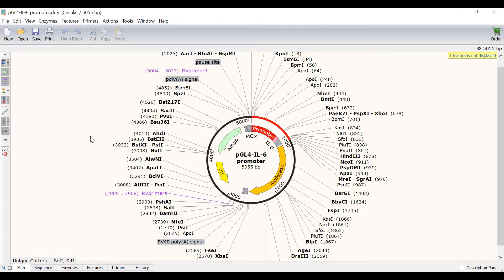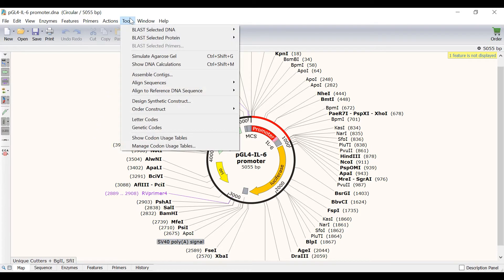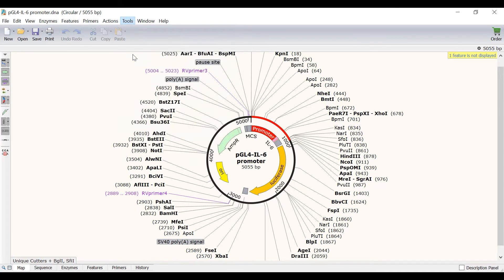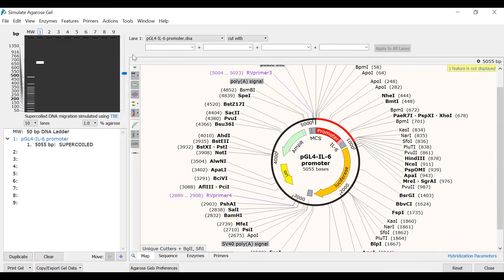To simulate agarose gel electrophoresis, go to Tools, then Simulate Agarose Gel. A new window will open showing the agarose gel simulation in the top left, information about the lanes below this, and the map view of the file on the right.